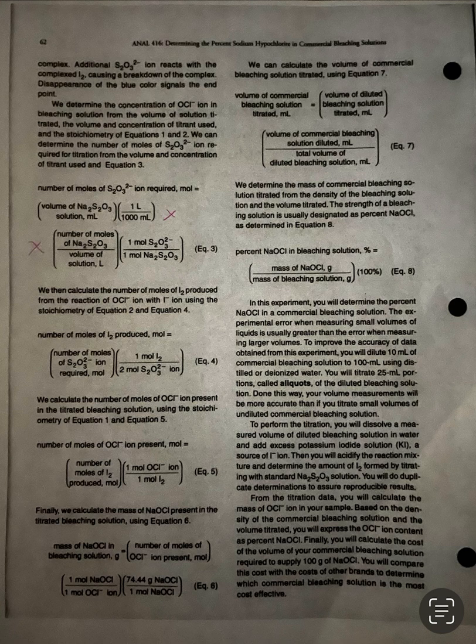So the mass of sodium plus the mass of oxygen plus the mass of chlorine. Therefore the mass of sodium hypochlorite is 74.44 grams in 1 mole of sodium hypochlorite. So you'll be using that number as well. So you know the number of moles of hypochlorite ion from equation 5. You know that the ratio is 1 to 1 moles, and you'll have to multiply it by 74.44 grams of sodium hypochlorite.